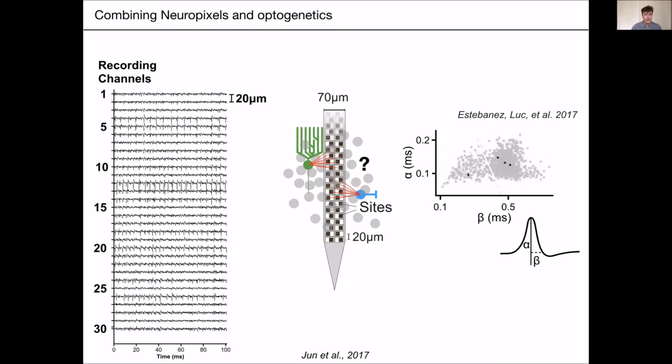And one of the most widespread ways to obtain ground truth data in modern neuroscience is to use optogenetics. You can express channelrhodopsin specifically in your neuron of interest, here a local interneuron, and then first shine light on the brain in the first part of the recording, and later study their physiological activity and plot them in this feature space and look where they fall on these clouds. And the authors of this paper, for instance, decided to draw a line there, which is a debate for another day, and call all these neurons probably parvalbumin-positive interneurons.